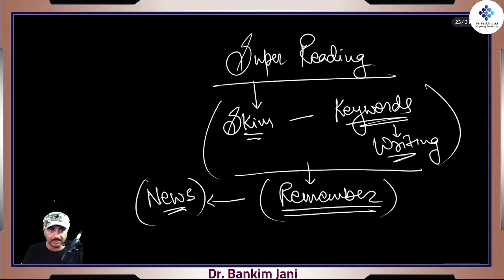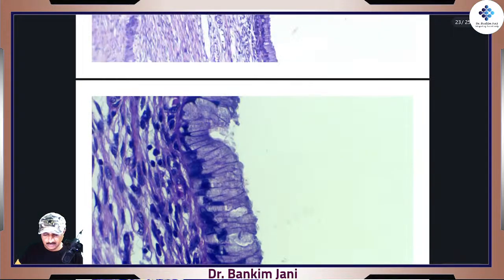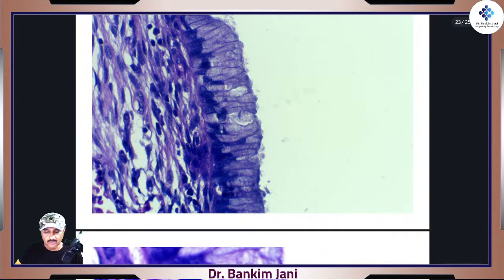A question: checking for ciliated or non-ciliated is confusing, how to be sure if cilia is present? Definitely, just by the looks. See, non-ciliated. Literally, there cannot be any doubt. Watch this image over here.